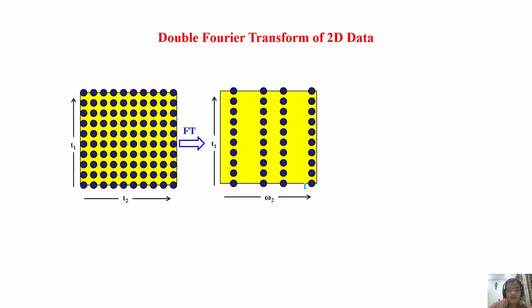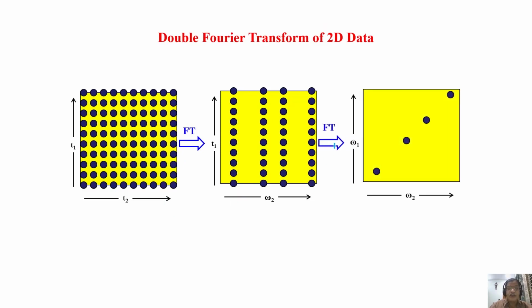Let us say we have 4 frequencies present here. In the T2 dimension, we have 4 peaks. But in the T1 dimension, it is still a data point like this. It is a time domain signal. It is a varying signal. Okay. Now we do the Fourier transformation. Also simultaneously or immediately after this, we do the Fourier transformation in the T1 dimension also. Now we are going to see only frequencies. In this dimension also you get frequency. In this dimension also you get frequency.